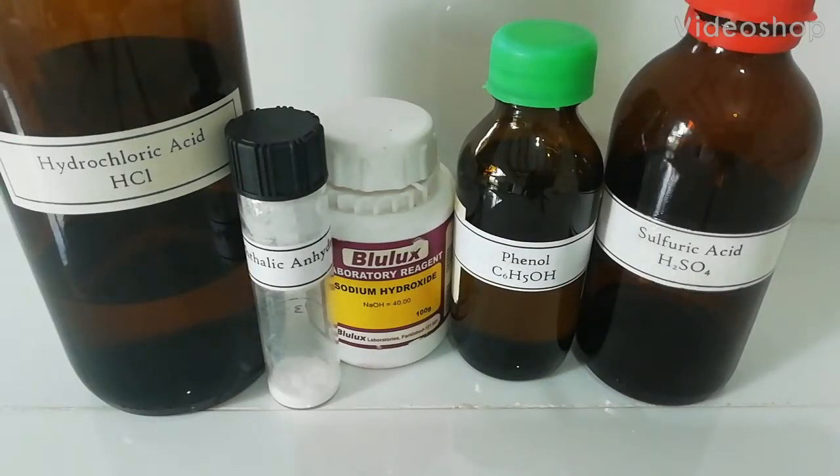Phenolphthalein is a very common indicator used in titrations. In this video I am going to show you how to make phenolphthalein. Here I follow the YouTube channel Nile Red's method to make this phenolphthalein.